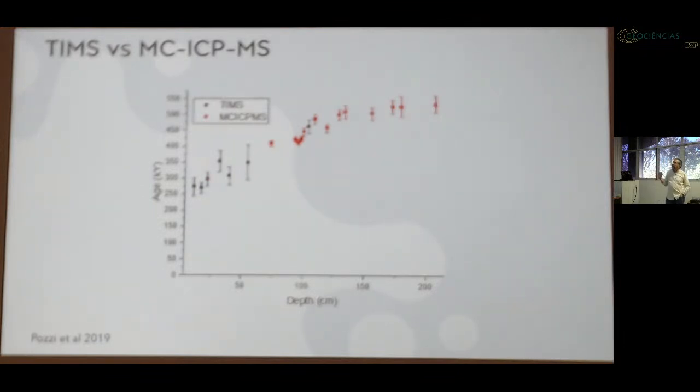Immediately you see that there's a little bit of a change. This is the age model for that stalagmite. And immediately you can tell that there's a difference between TIMS and multi-collector ICP-MS. Why do I like this example? Because they were run in the same lab, on 2 different instruments, a stalagmite with the same amount of uranium, following exactly the same chemical procedures.